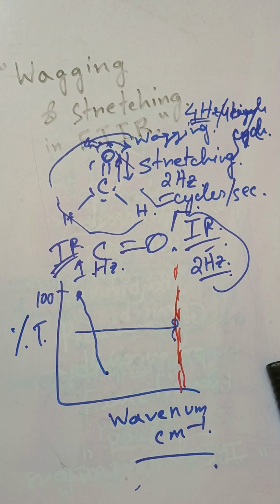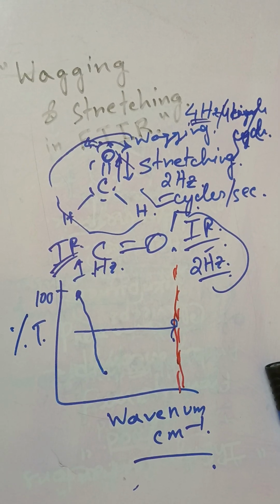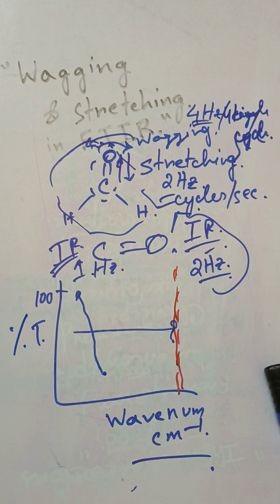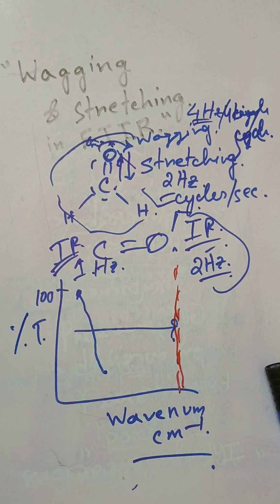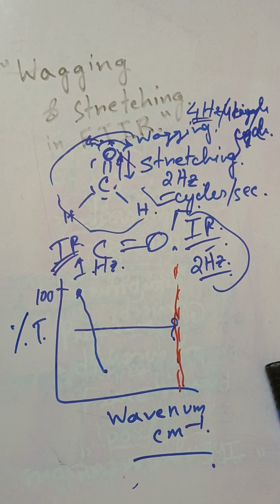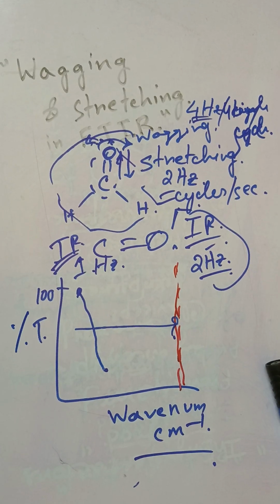In this way the infrared spectrometry works. This is the basic principle, but the actual FTIR graph you have seen in journals, published papers, YouTube or other educational tutorial videos is much more complicated.